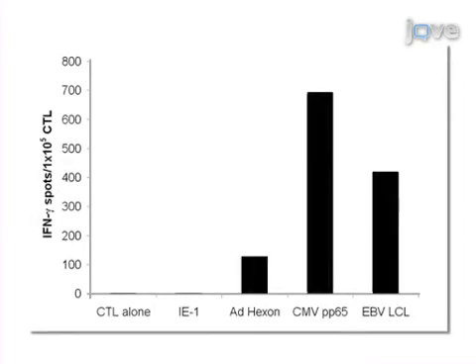Ultimately, the specificity of the expansion of the CTL for at least one viral antigen can be evaluated through ELISpot analysis and cytotoxicity assays.